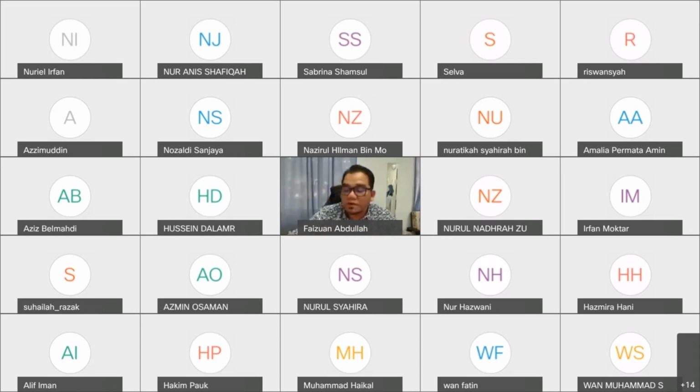And today we will learn the second part. We will learn about the second instrument, which is atomic absorption spectroscopy. I will share the slide now. I'll wait for a while.